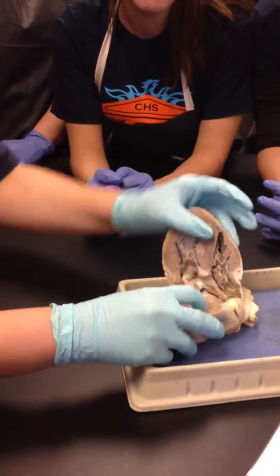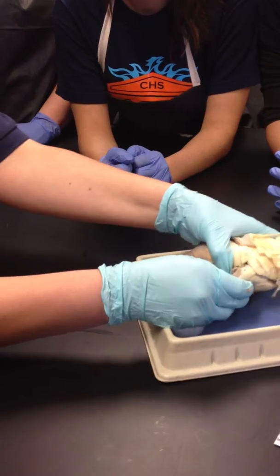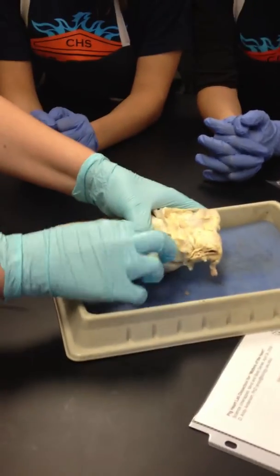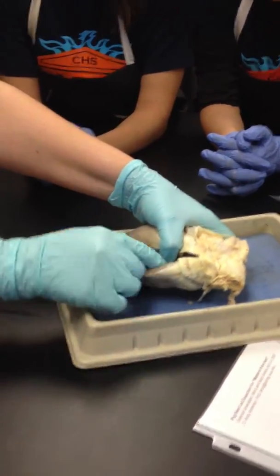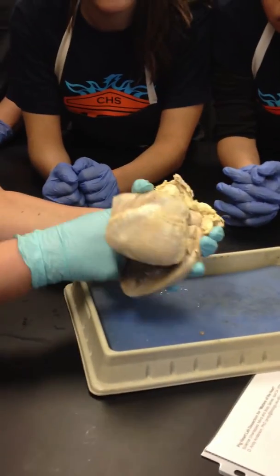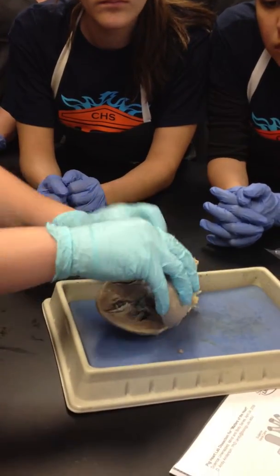It might be on the other side. If I stick my finger in, and this is the right side again, I just flipped it around, you should be able to see the pulmonary valve in there as well. There's the pulmonary valve on the inside, and this is going to be the pulmonary semilunar valve. It's going to separate the trunk from the right ventricle. If I stick my finger in there, it should go into the pulmonary trunk, so I can identify the pulmonary trunk for you if you need it.